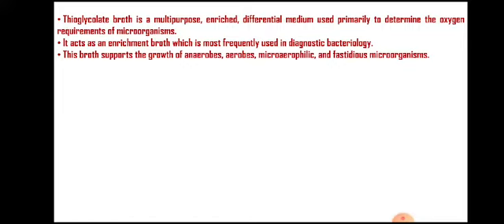Depending on the differences in oxygen requirements, there are several categories: some bacteria are anaerobic, some are facultative, some are aerotolerant, some are strictly aerobic.